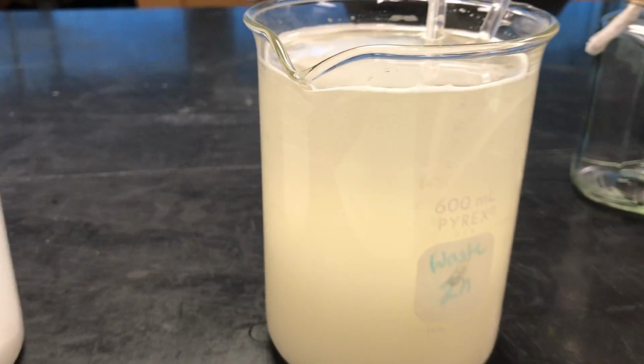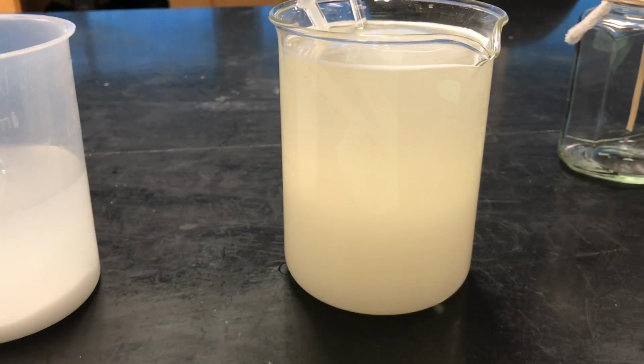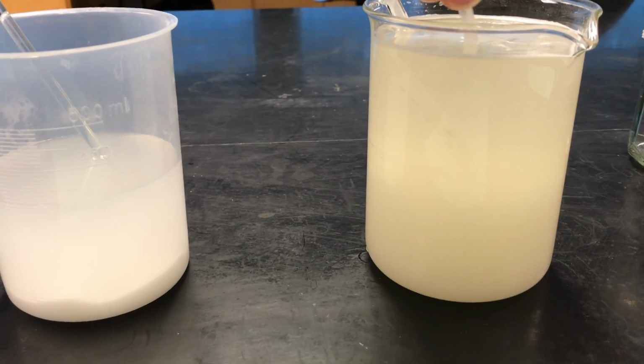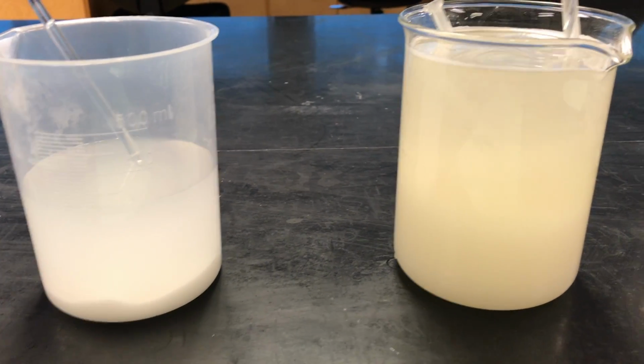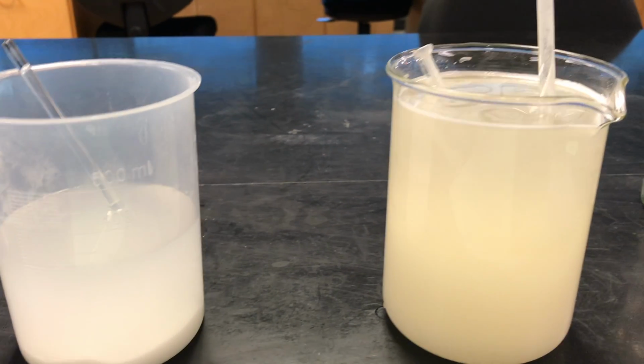The other one I did, I thought sugar would be really good to do because it would make something that was delicious. So I did the calculations for sugar's solubility, and it is an alarming amount of sugar that you can dissolve in 250 mils of water. So I wasn't even sure it was going to fit in the beaker.